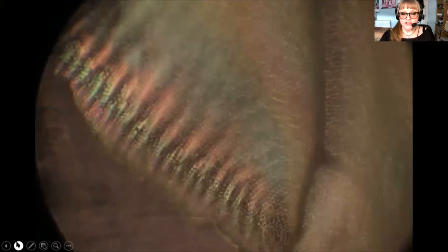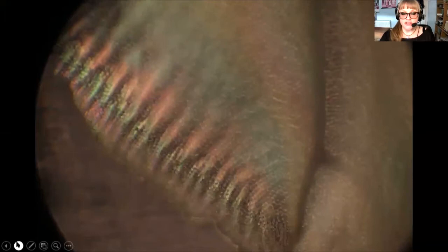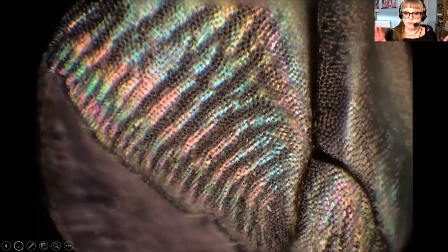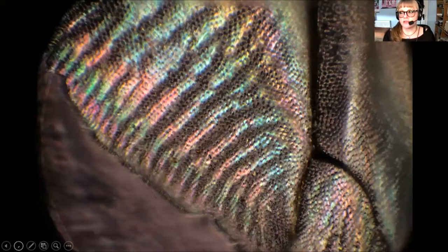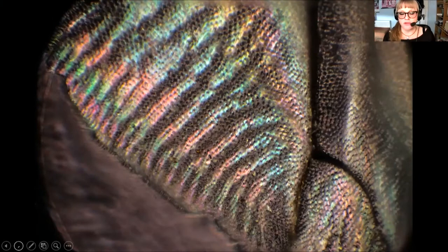I'll just get that to skip forward so you can see that as you skip through the photographs, there's different bits of it that are in focus at any one time. This was just a small amount of pictures, and basically focus stacking them gave me this result. This was obviously stacked and then processed, and it's a really simple procedure to follow but it has some really dramatic results. This is just done manually, so it doesn't give you the entire focus range that a different method that I've been working with would give you.